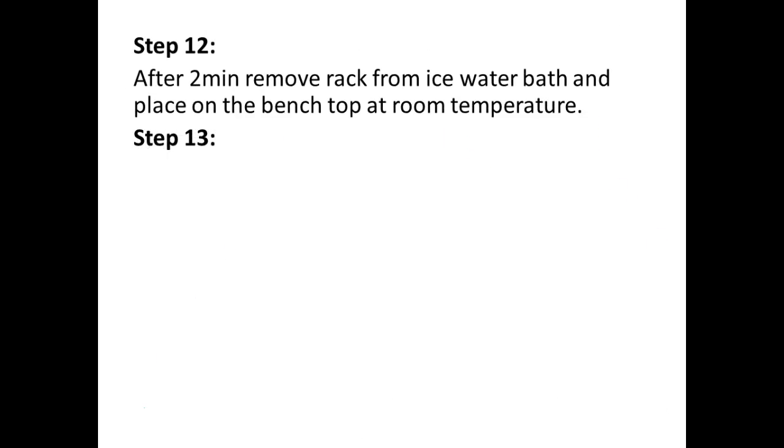After the 2 minutes, you're going to remove your rack and just place it right onto your desktop. So now your tubes are going to be at room temperature.